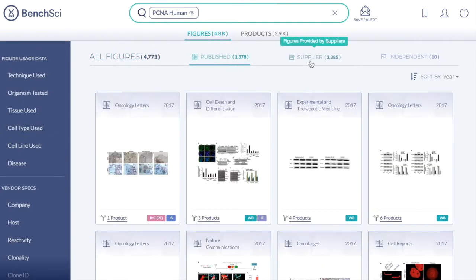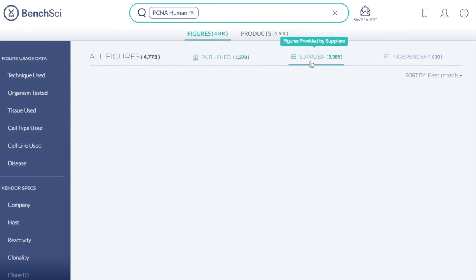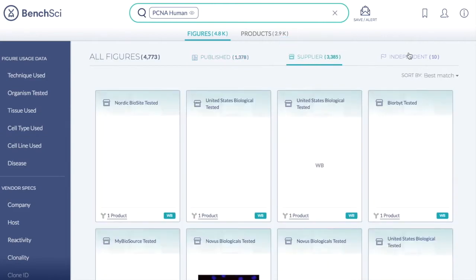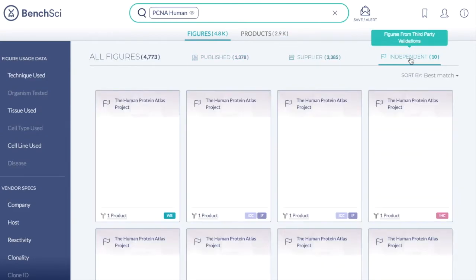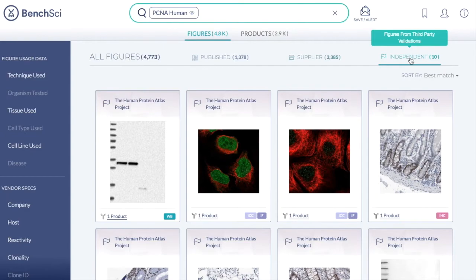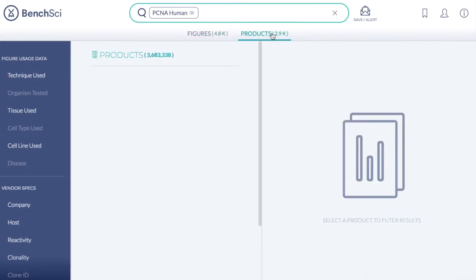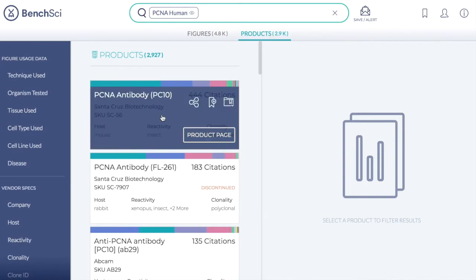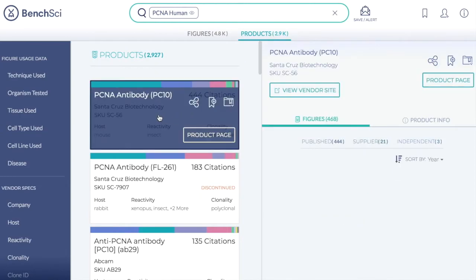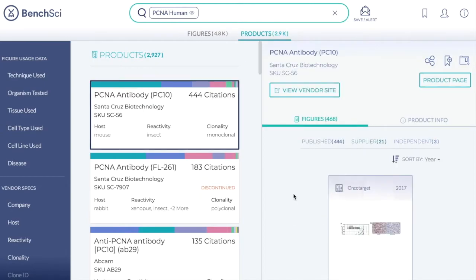You can view images provided by suppliers from in-house testing, or validation data from independent research groups such as Human Protein Atlas or ENCODE. Within our product database, you can view a list of antibody products and the figures in which they were used.